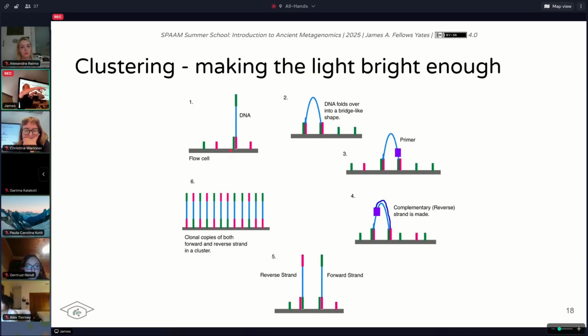There's a space around each synthetic oligo on the flow cell, but you also have lots of complementary oligonucleotides very closely around this original one. So it's not just an equal lawn. You have little clusters of these things.